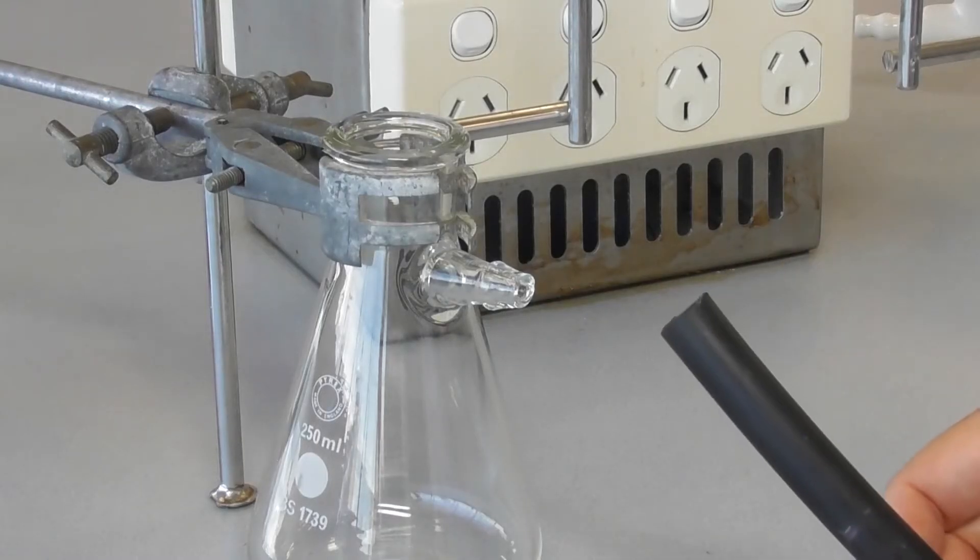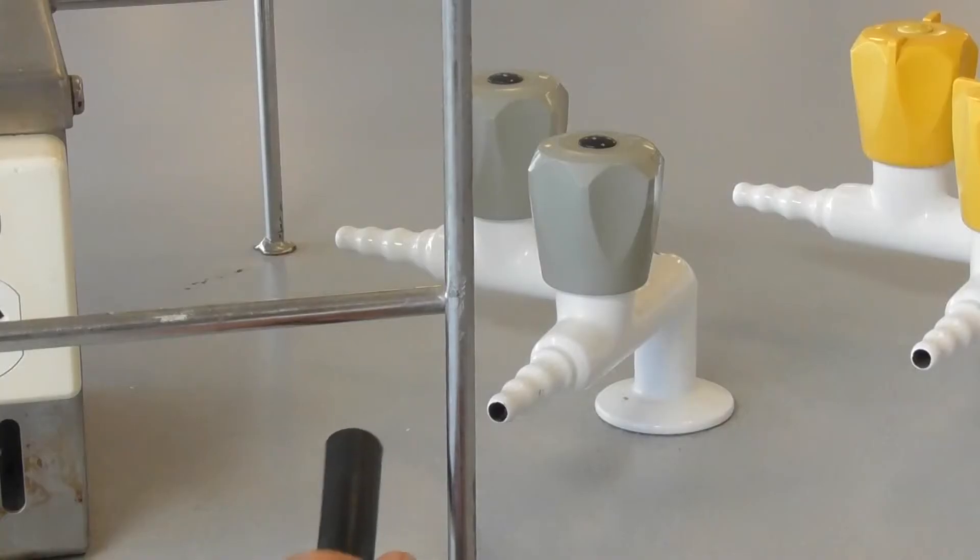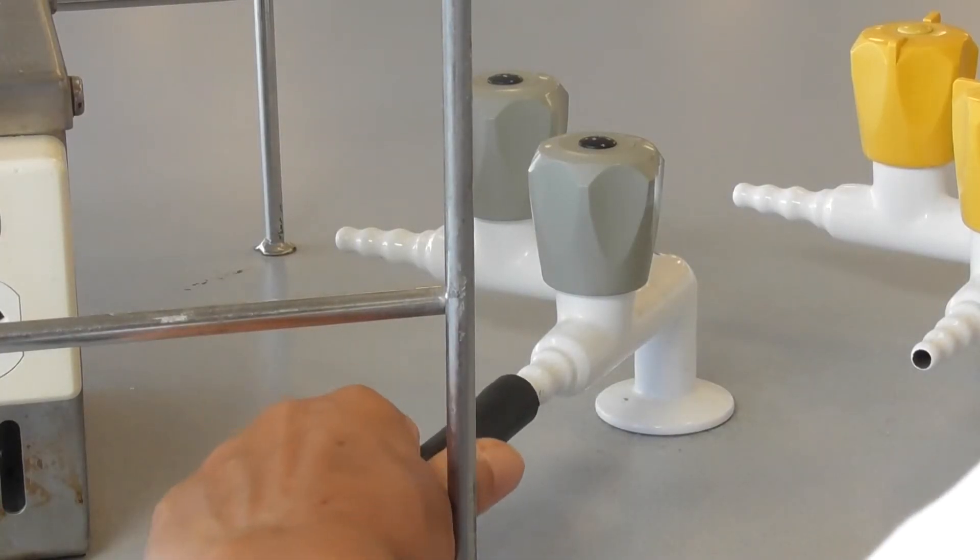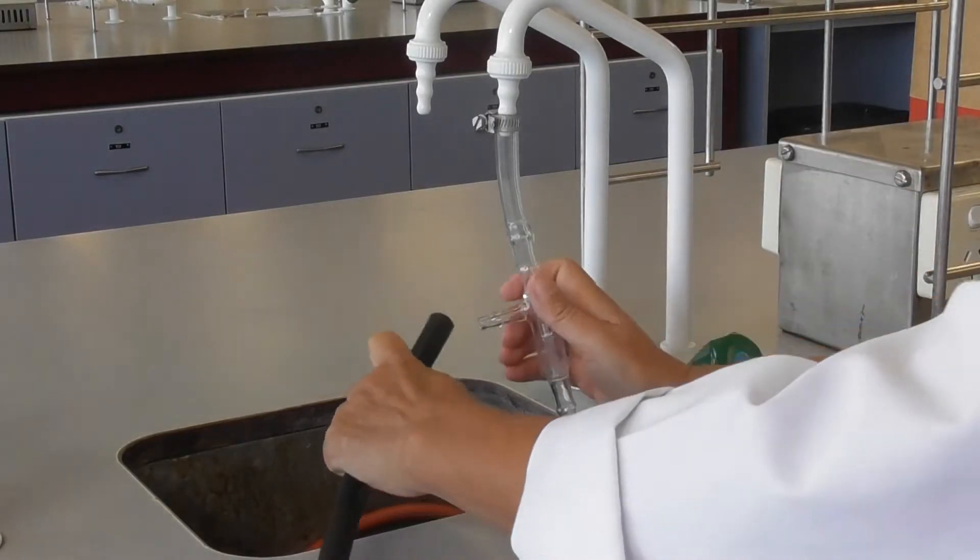Connect the vacuum hose to the short tube on the flask. Connect the other end of the hose to a vacuum source which will generally be a vacuum tap or an aspirator.